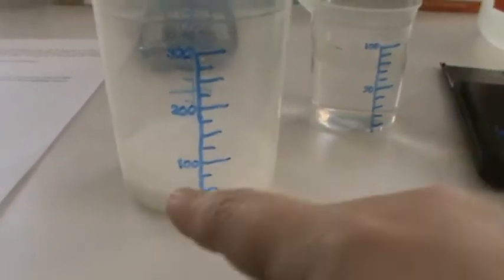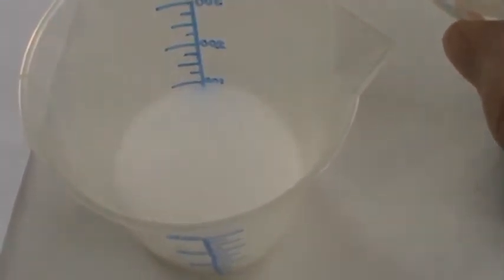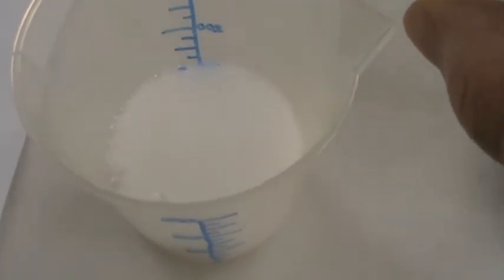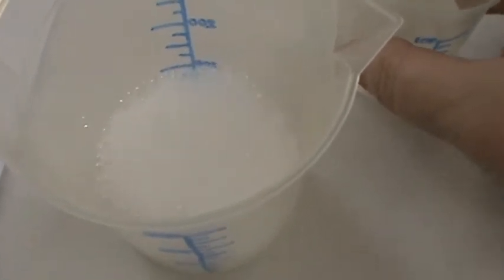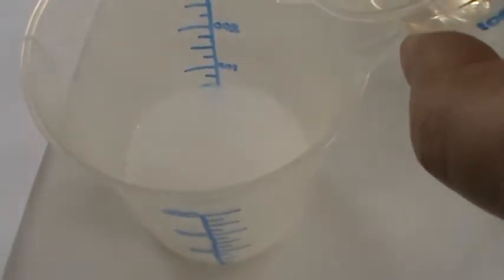And you see the bubbling action. Hopefully you can see that really well. And you can probably hear it in the video as well. Oh, yeah. There we go. Lots of bubbles. All those bubbles are the carbon dioxide gas being evolved from the reaction, and they're escaping.